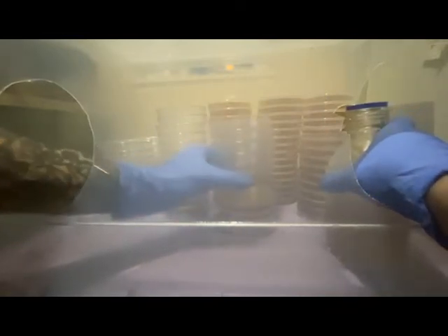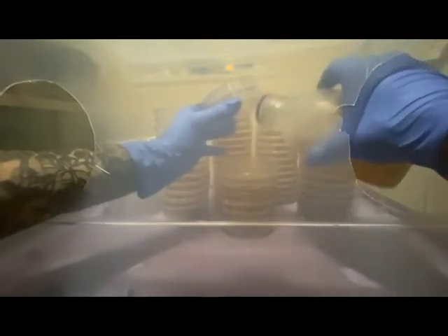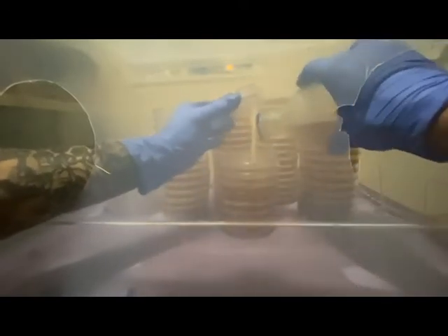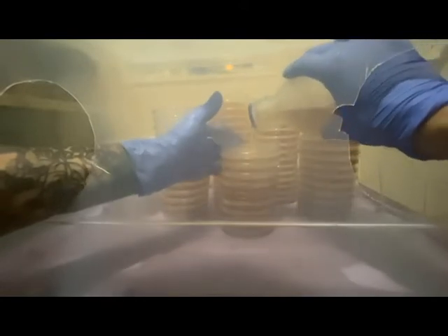See, and this is why you want to be fast. We got some chunkiness going on. So this bottle might actually be hit. We'll see. You start getting clumps. And sometimes the clumps will surprise you. You'll be almost done pouring a Petri's worth, and then a clump will come out. And the next thing you know, you have an almost overflowing Petri dish. Gotta be careful.